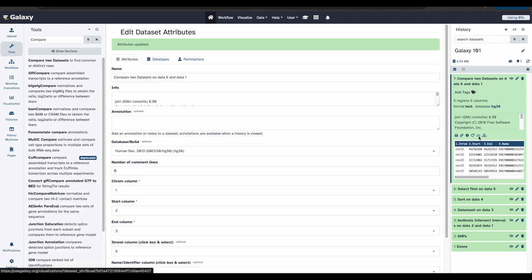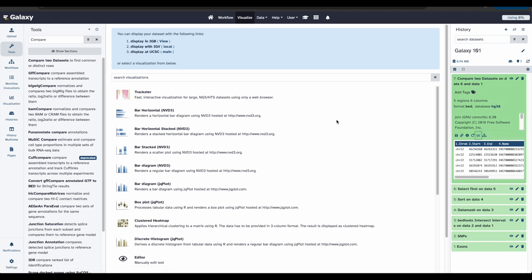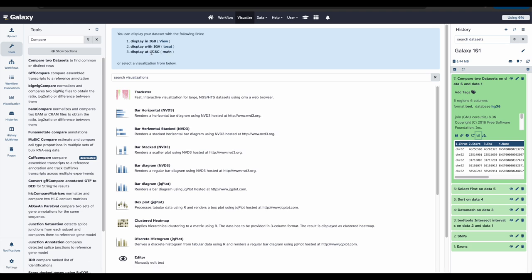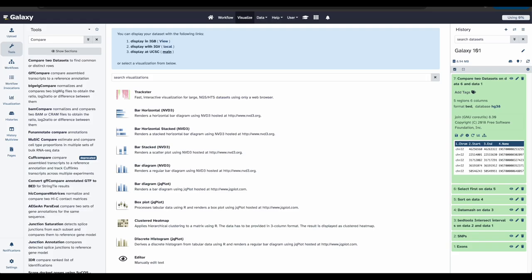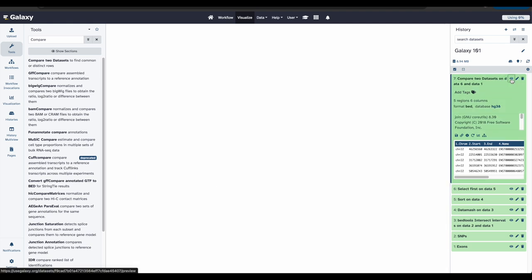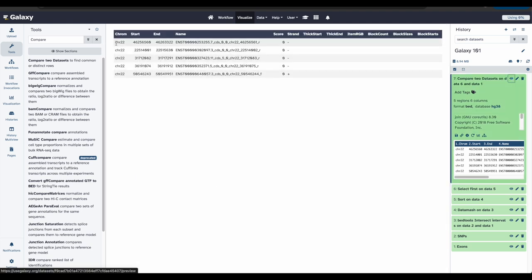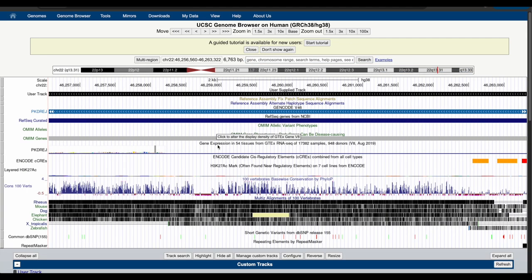To visualize the data in UCSC Genome Browser, click the main link next to display at UCSC. This will upload the data to UCSC as a custom track. To see your data at the user track, we can go back to galaxy and copy the coordinates of one of the exons and then paste them. So here, let's view our data, and let's copy the coordinates. Let's go back. We can paste them right here. And click search. This jumps to that location. Okay, let's go back to galaxy.